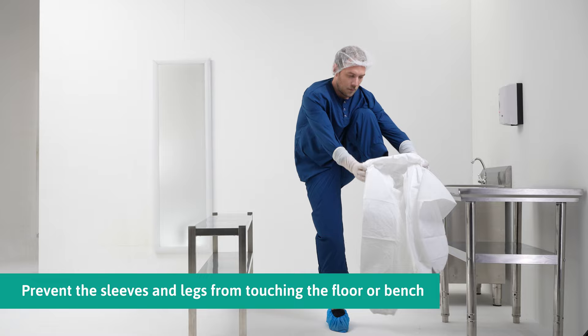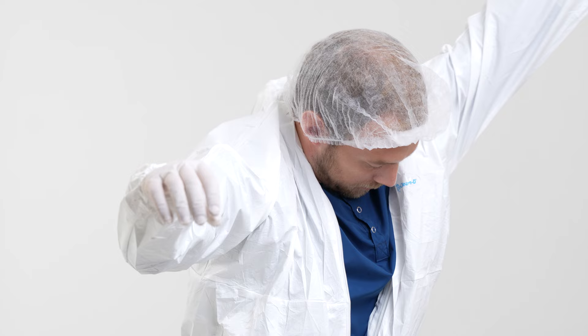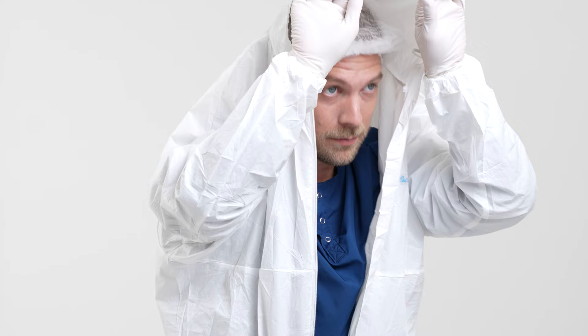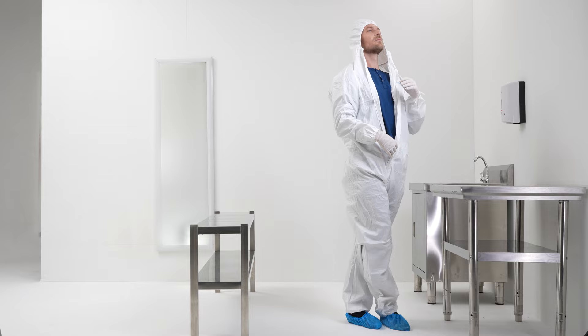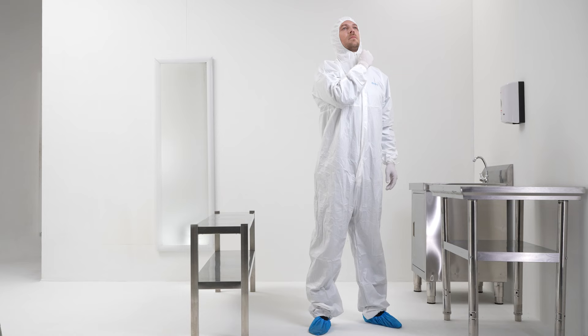Carefully insert one leg into the coverall, then repeat with the other leg. Bring the coverall up towards the shoulder, then insert the arms into the sleeves. Hold the hood over the head to make sure it covers over the hairline. Cross your legs and zip up the coverall fully. Remove the backing liner and stick the flap over the zipper.